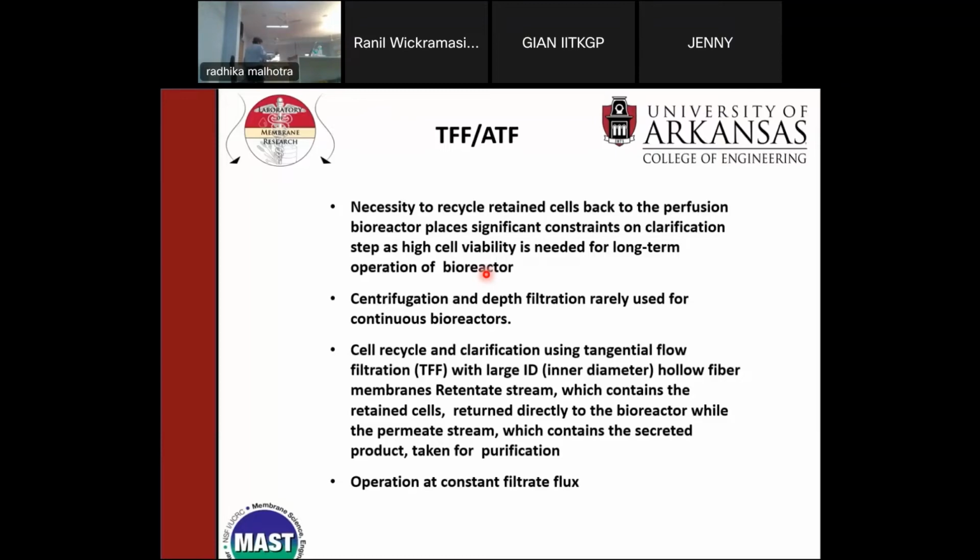Tangential flow, but it is sterile. The next problem is that you don't want the cells to go through a very hard flow path. If you don't, they're not so viable, they may not grow so well. You don't want to change the character of cells. This is all making it very difficult. This is a challenge. Centrifugation and depth filters just don't work.